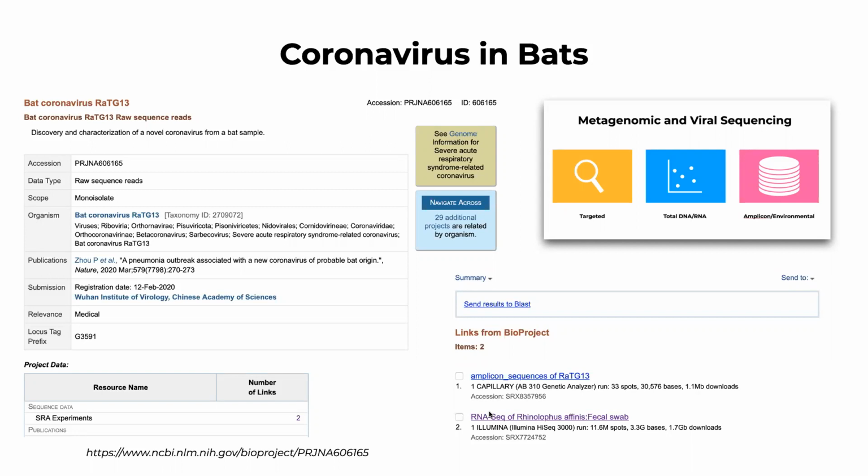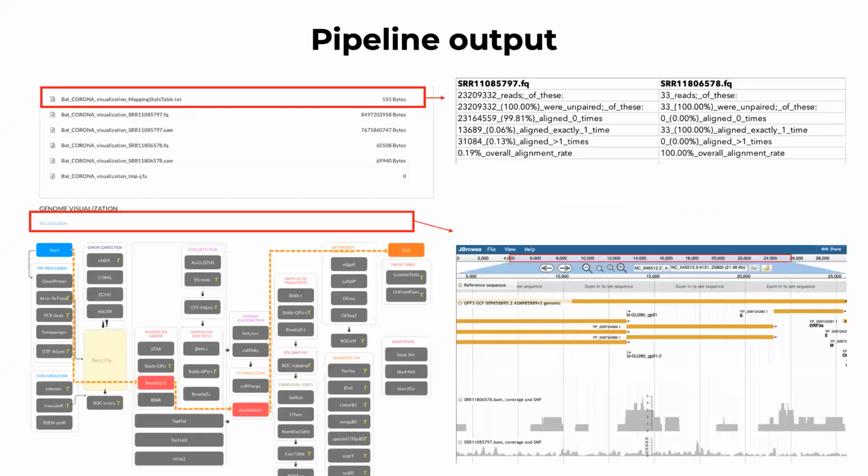So total RNA, or how exactly did they do it? Total RNA or not total RNA? We need to find out, but we know that it measures gene expression. But we do expect those cells to produce virus as well. So what we can do here is start doing the same thing, right? But instead of me giving you files, we can do this in a different way.